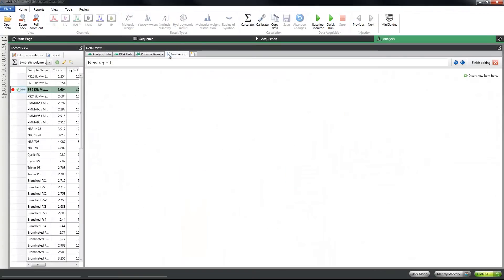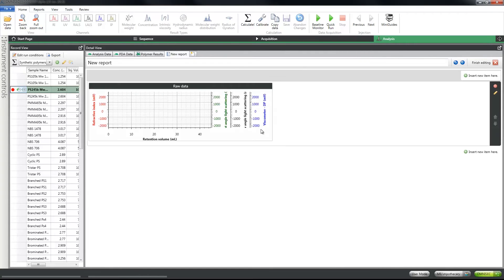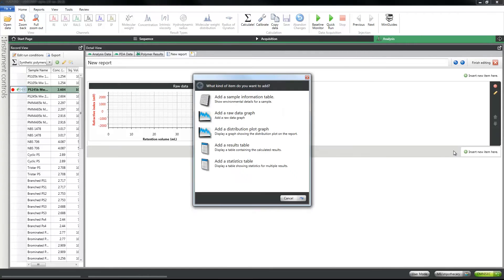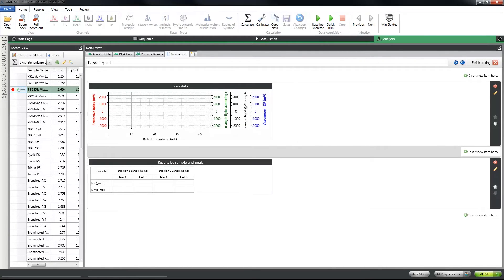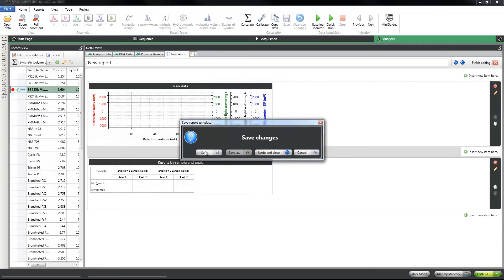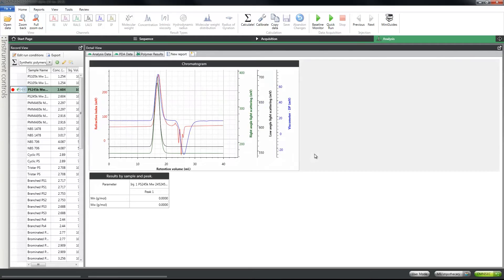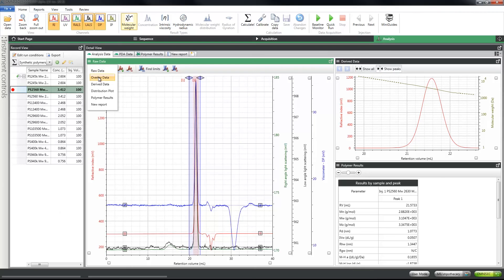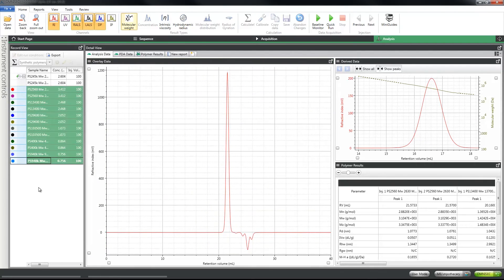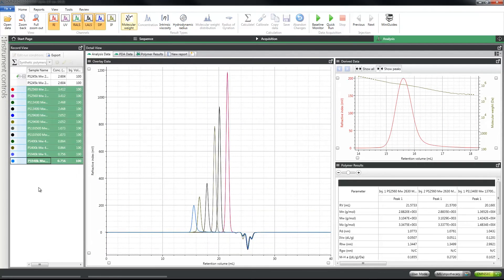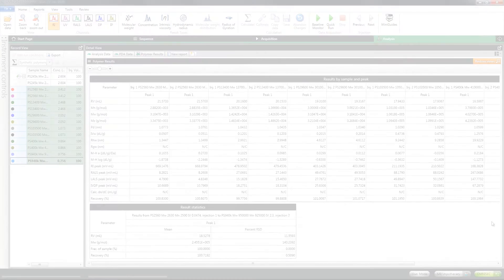Key features include an intuitive look and feel based upon the latest software tools, as well as simple and customizable reporting to present only the data that is most important to you. Multiple injections and results can be overlaid quickly and easily, and it now only takes one click from data to results.